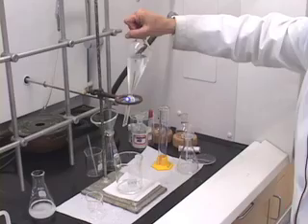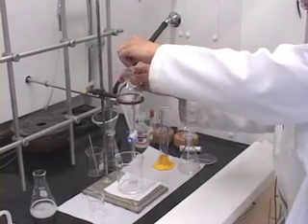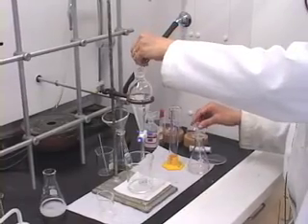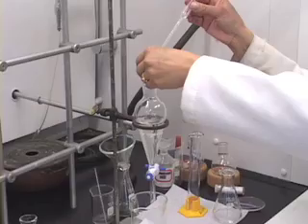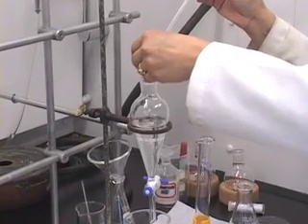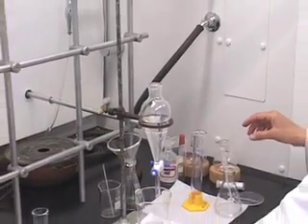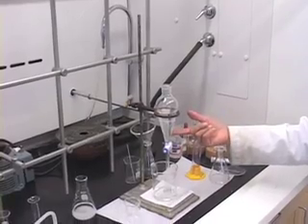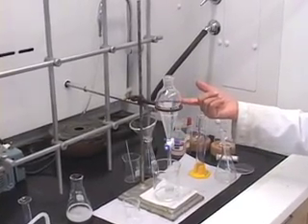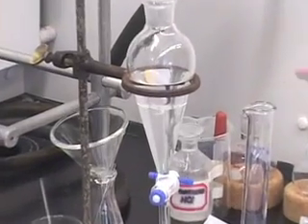Then put it back on the ring stand. We need to rinse the stopper and put the stopper on the kim wipe. Let the layers separate. We have the bottom aqueous layer, the top organic layer. The organic layer has our acid component there now.